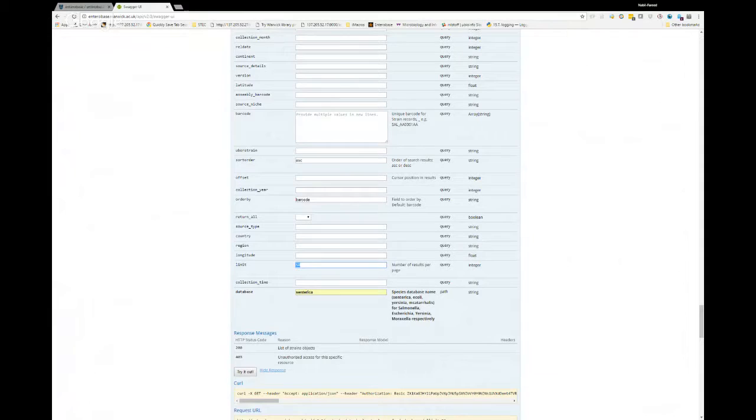Usually I recommend not bumping it more than about 300 a page for strain data, because strain data is actually giving you three tables worth of data back. So if you're querying just a single table like strains or alleles or loci, you can ask for maybe 1,000 at a time, just as a guideline of what tends to work as the fastest.